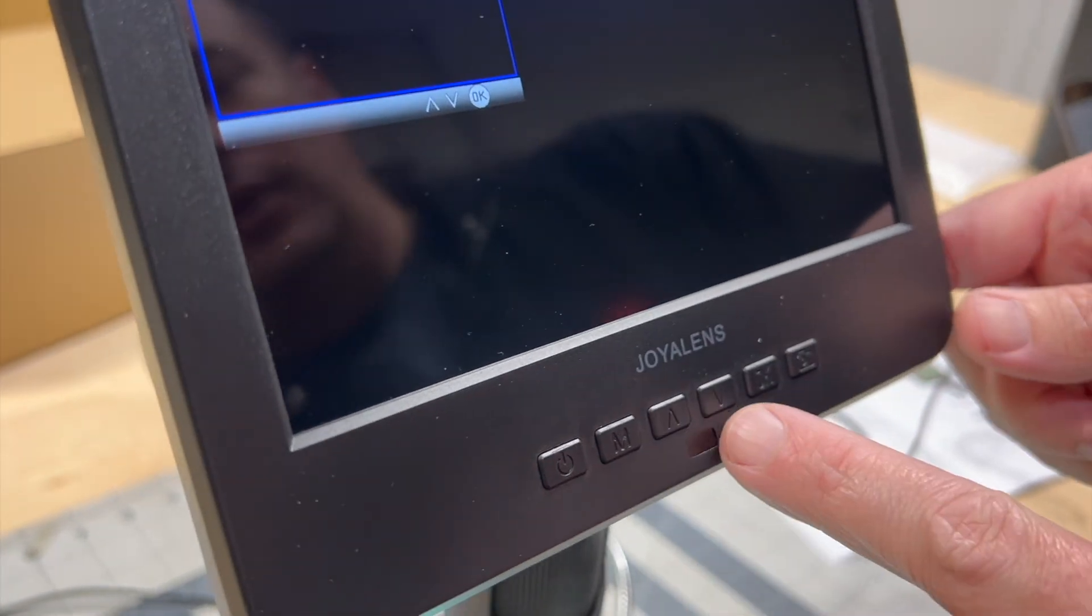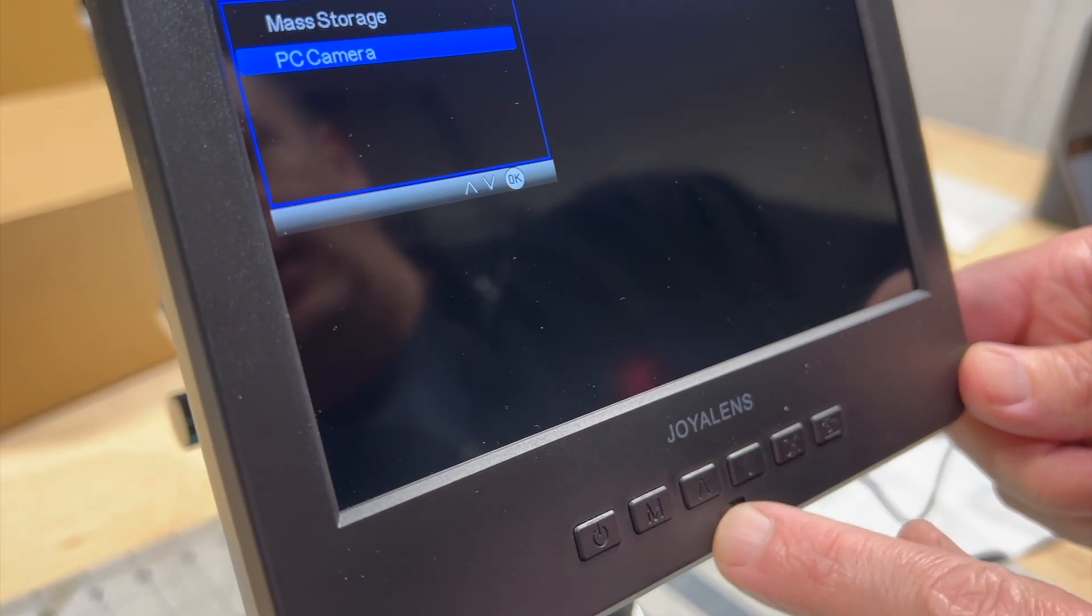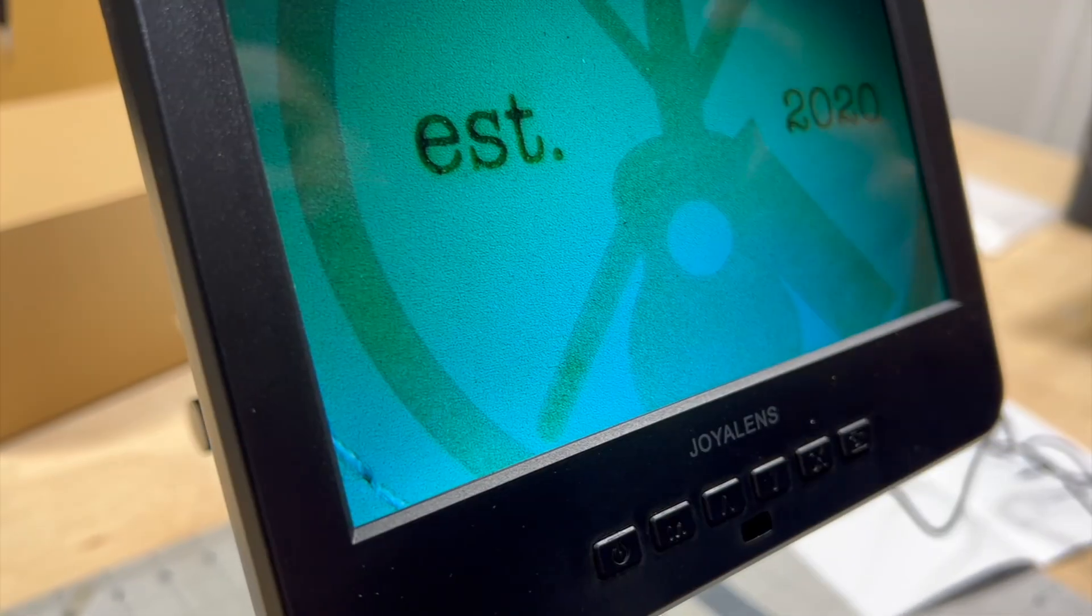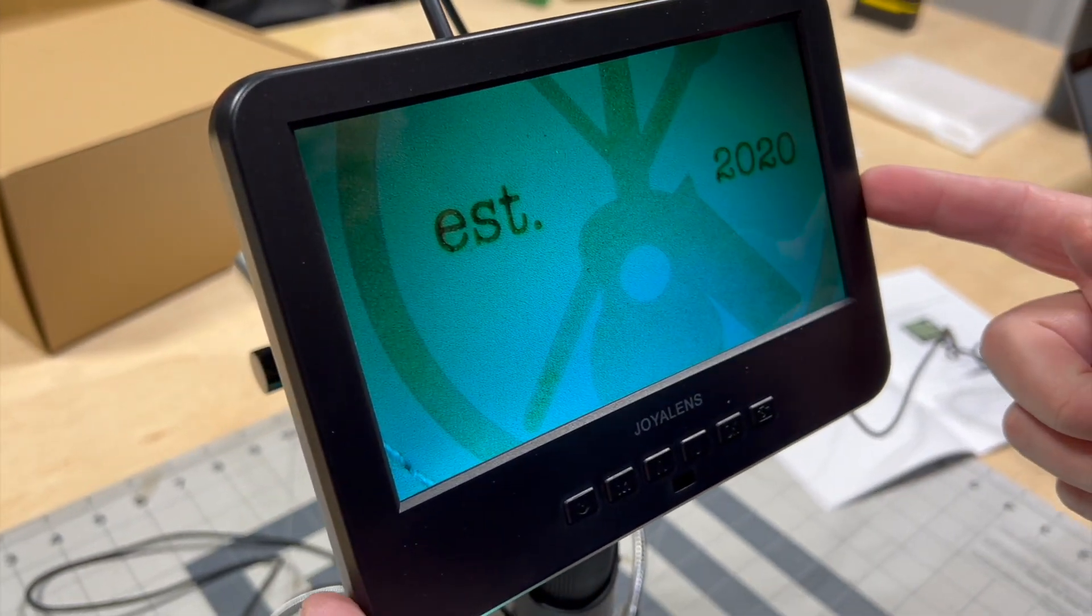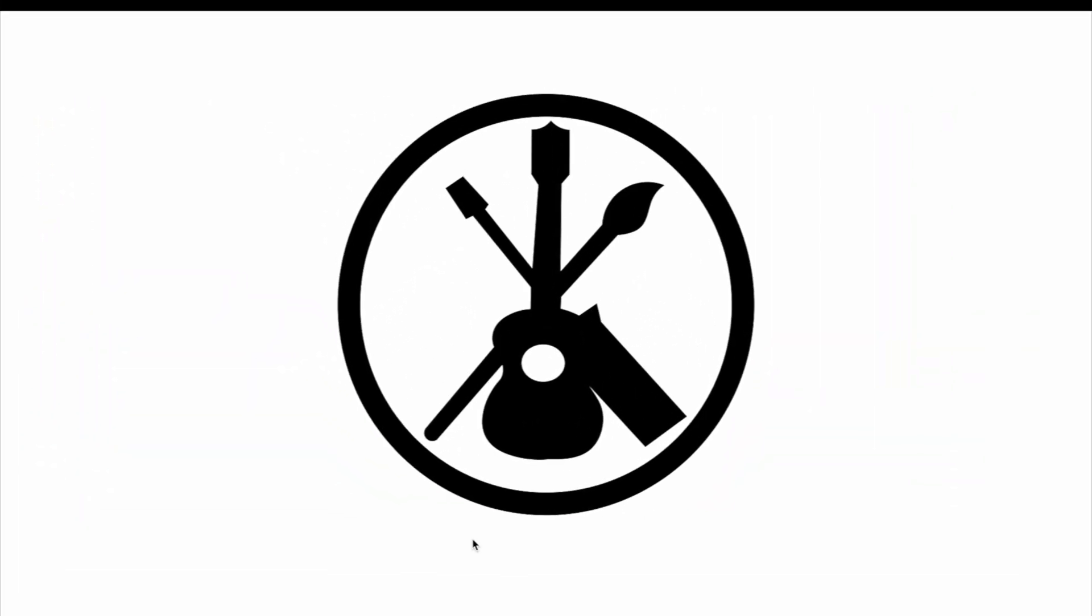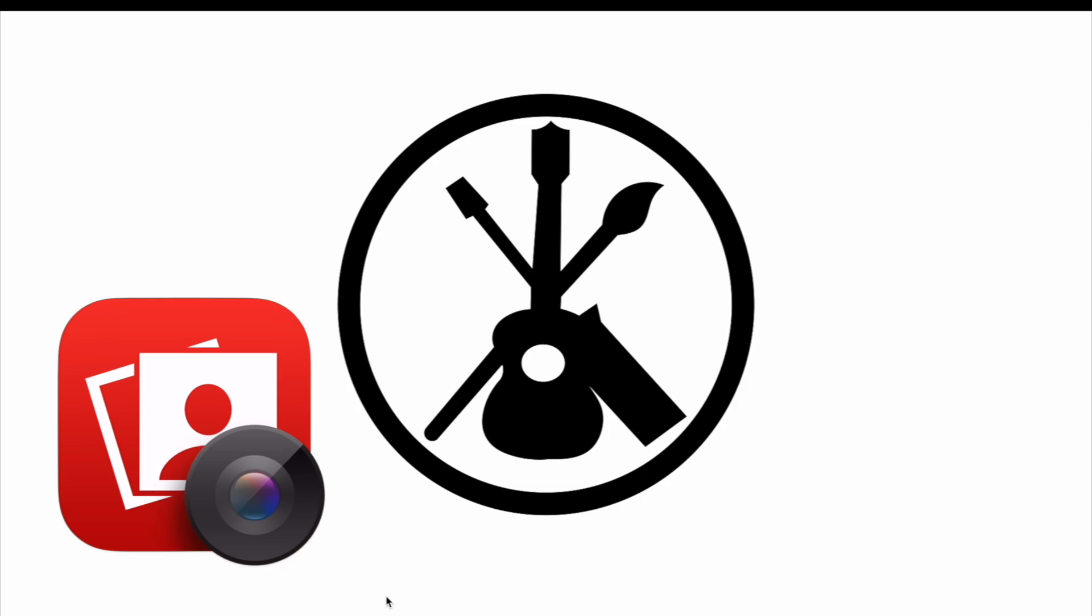Now it does come with a cable here and it's the same micro USB cable on one side that connects into our power source. But if we connect it to our computer via USB, it should be powered by the USB and it is a data cable that will bring over that video. So let's try that. Plug this into our dongle. Okay, so when we plugged in our new cable on the microscope itself, it has some USB connections that we want to go ahead and turn that to PC camera. So we're going to use our arrow buttons and okay, and now you can see we are being powered by the computer now for this LCD monitor and the microscope.